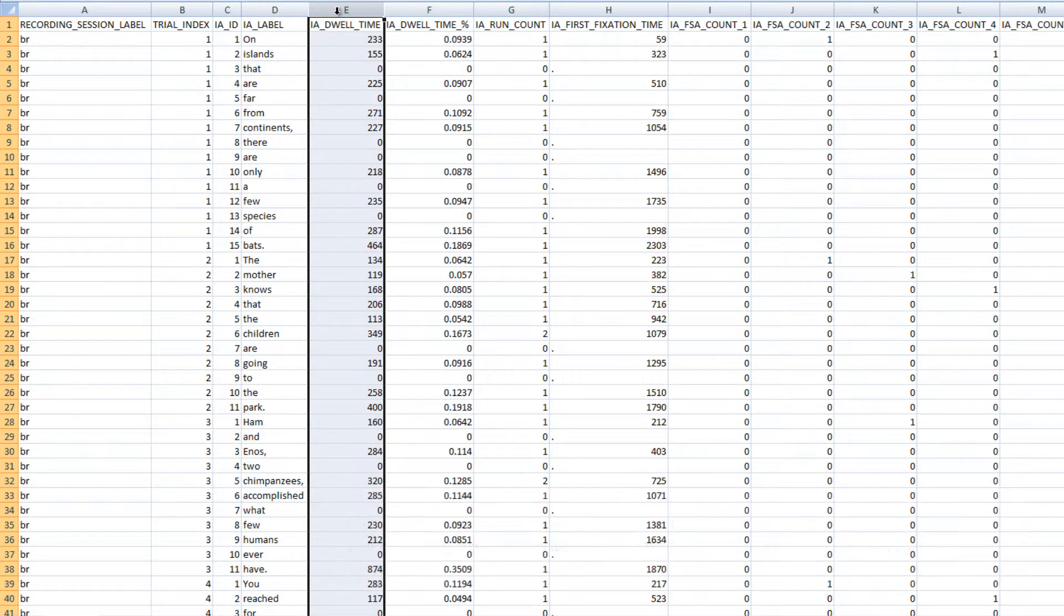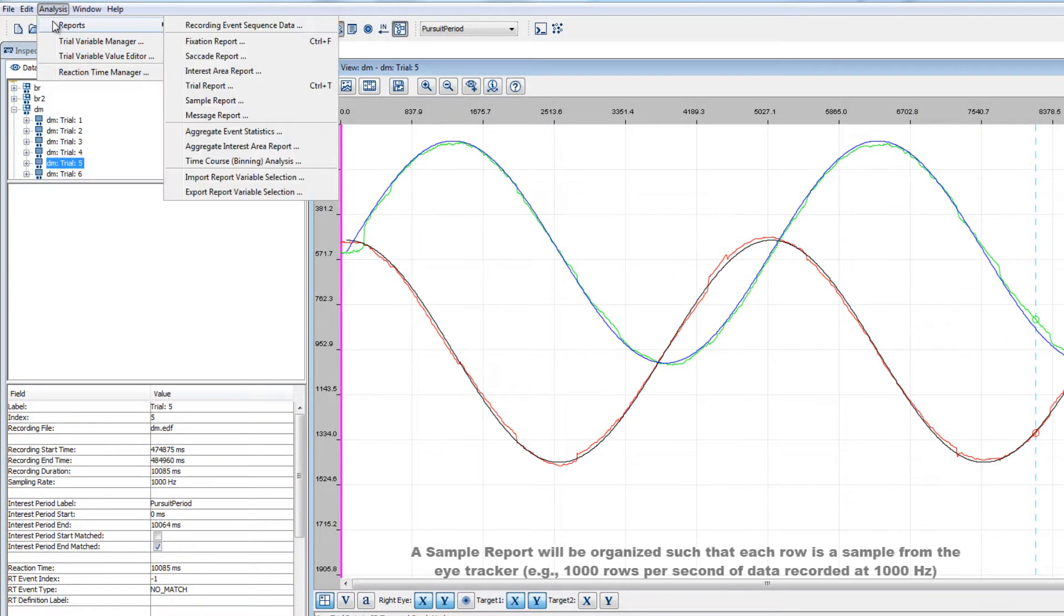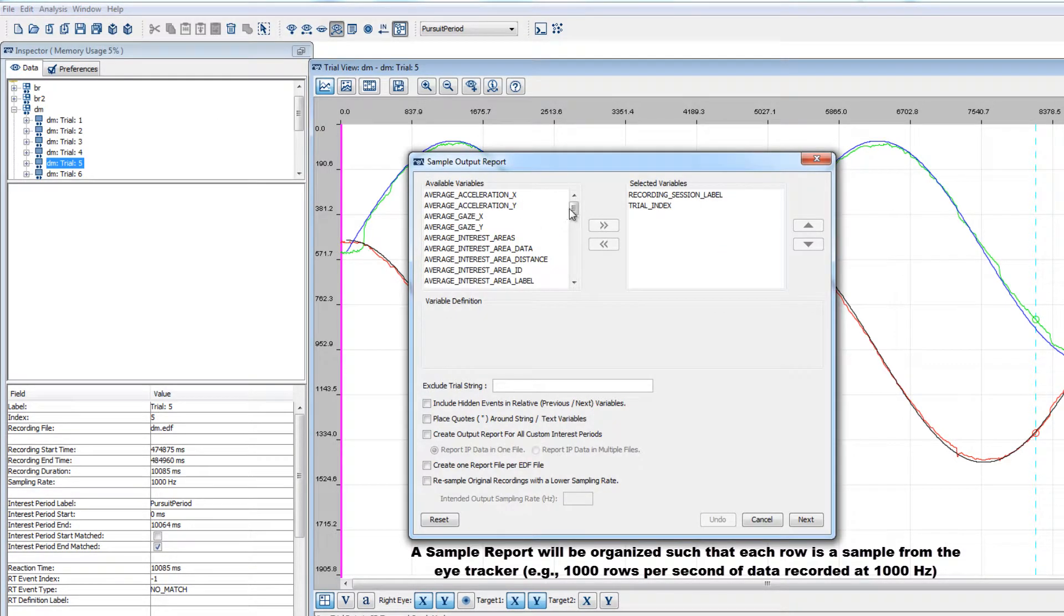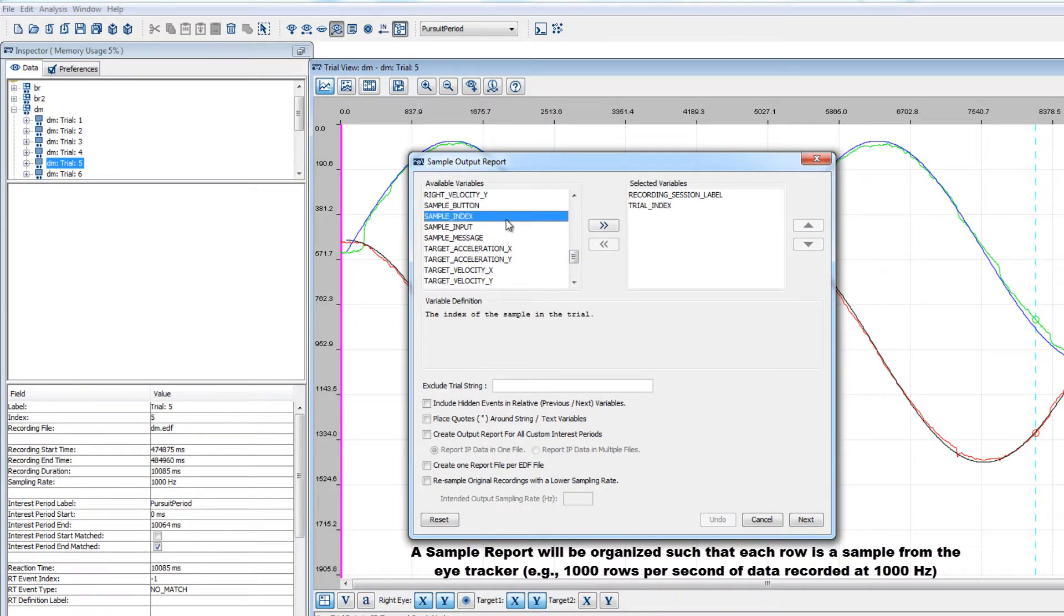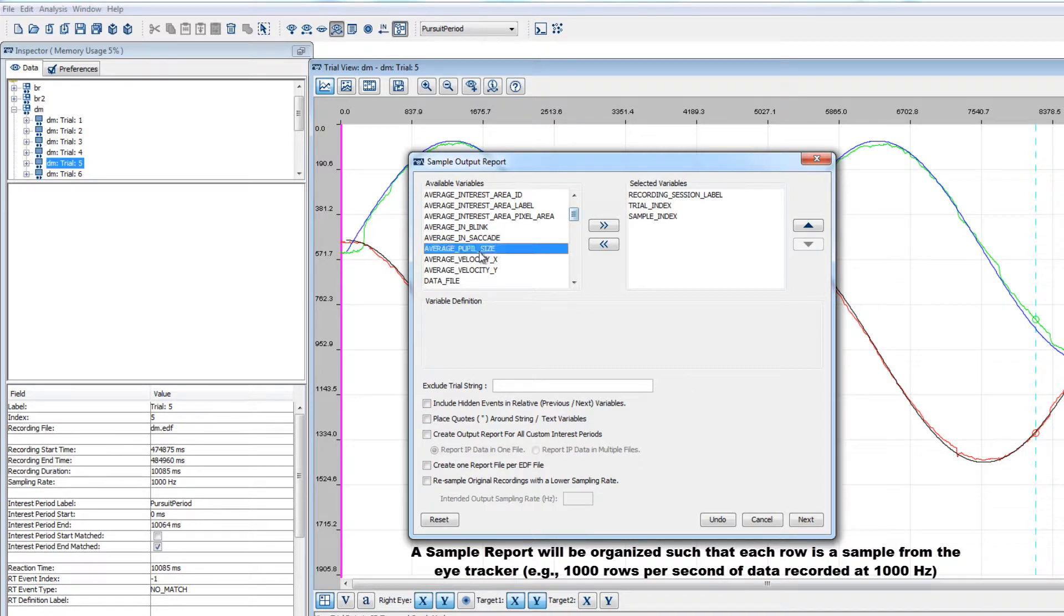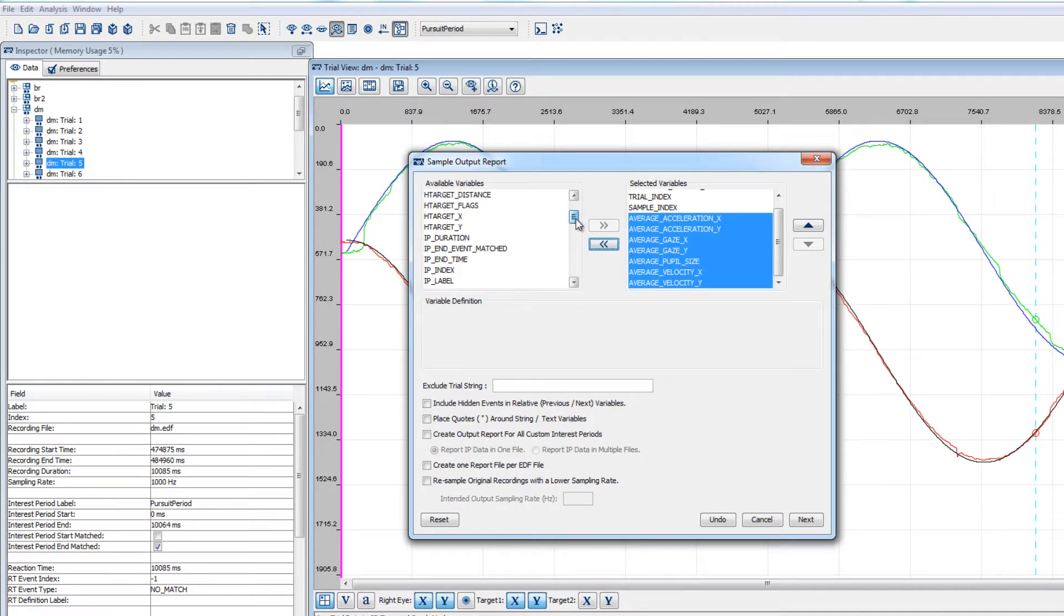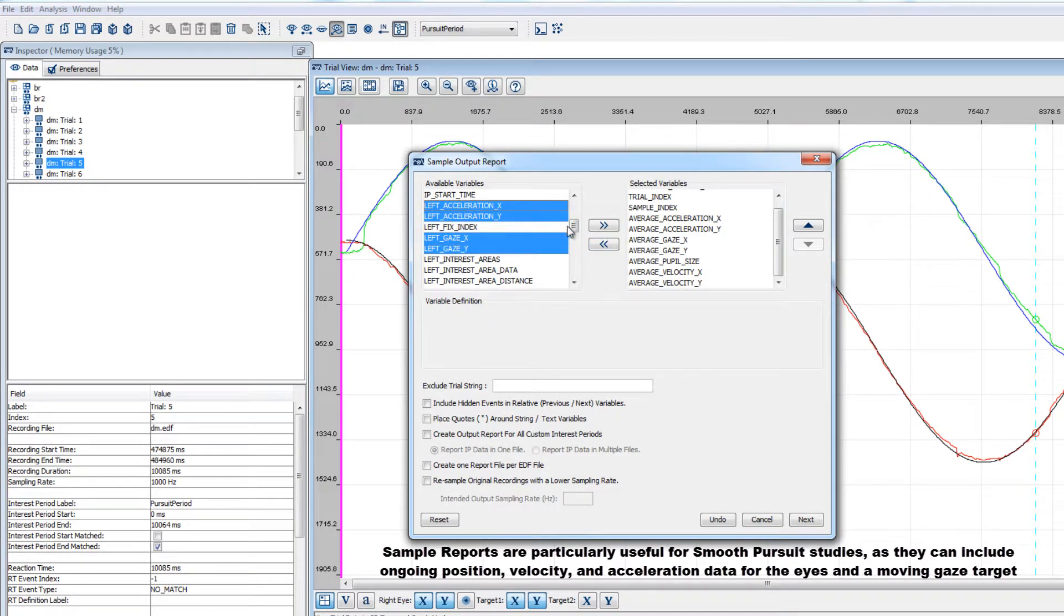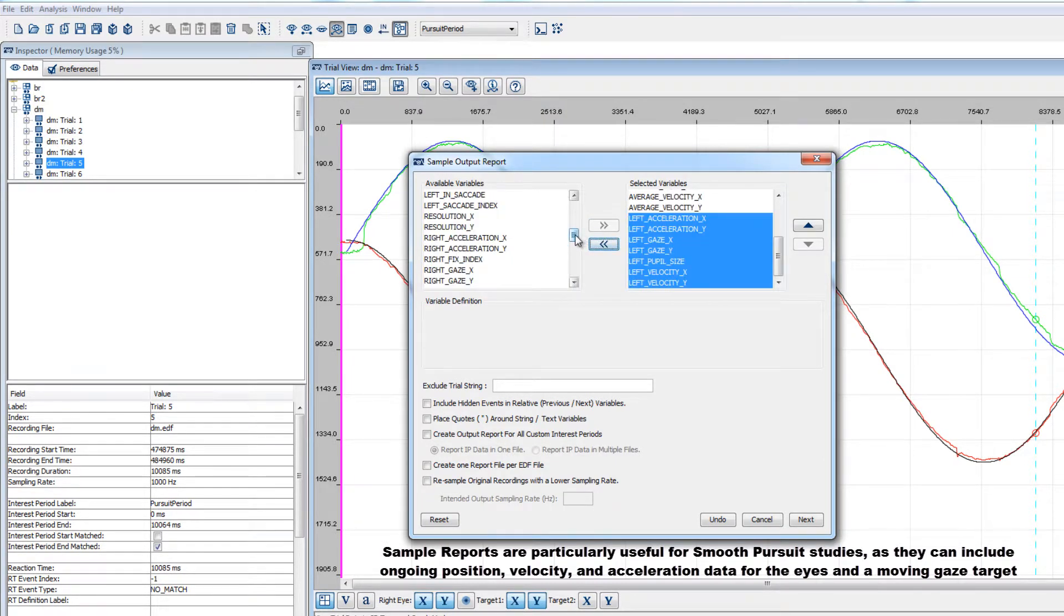If you want to look at the data at the finest level, then you can create a sample report. This will create an output file where each row corresponds to a different sample. So, for example, if your data were recorded at 1000 Hz, you'll have 1000 rows per second of recorded eye tracking data in the output file. This type of report is particularly useful for studies on smooth pursuit eye movements, where it's critical to have as much information as possible about the eye position over time.